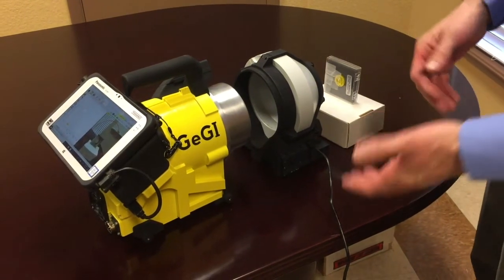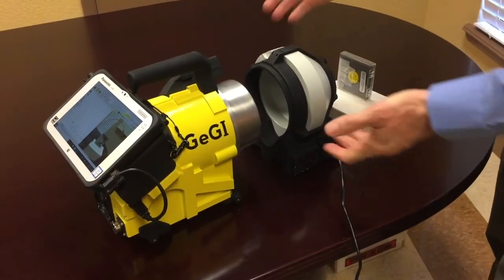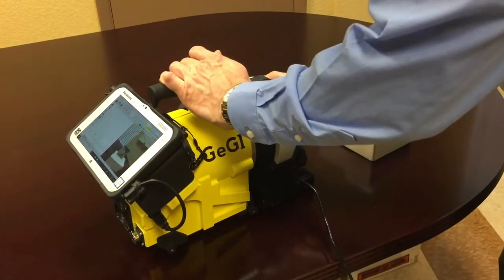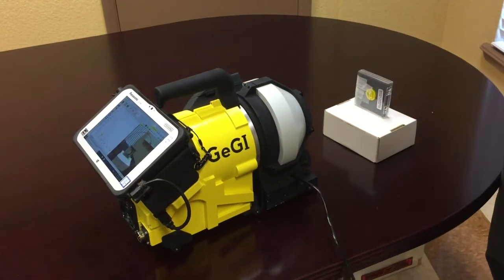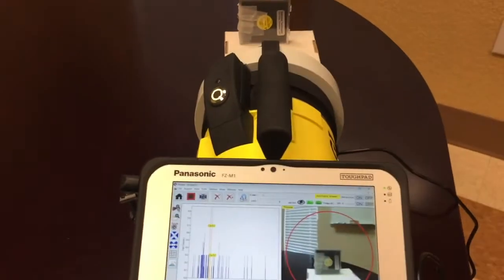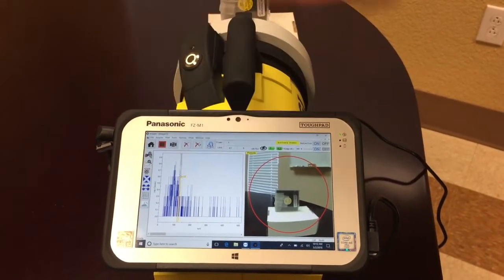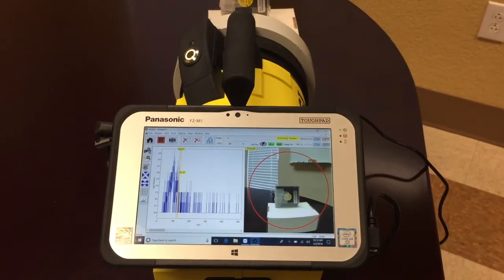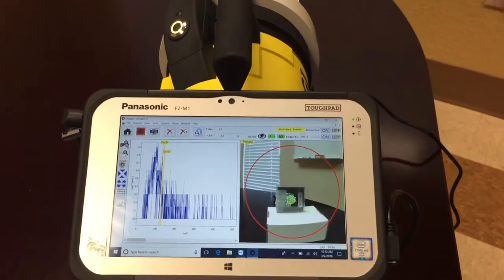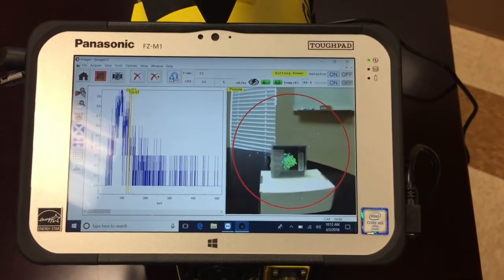And now we will demonstrate the pinhole imaging capability of the GG. To do pinhole imaging, we have this lead pinhole here. All we do to align it is simply push it up right against the front of the GG until it stops. Then we come around here and push the start button. On the left side here, we see the Cobalt-57 — you see the 122 keV peak and even the 136 keV peak. And as it accumulates counts, it then displays those on the optical output. You can see the distribution of the Cobalt-57 source there. So that is pinhole imaging by the GG.